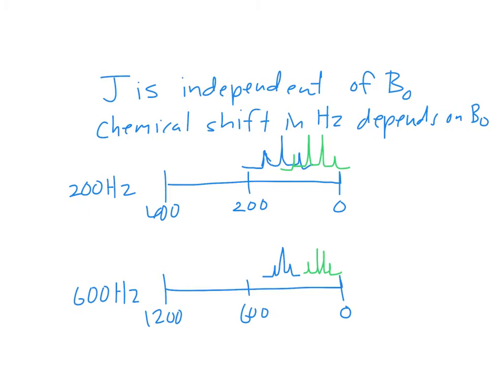Does everybody understand that? That's why you don't use a 60 megahertz anymore. Right. If you look at some of those old spectra, you know, it's like, yeah, the triplet or something takes up a half of a part per million or something, you know. Just look like it now.